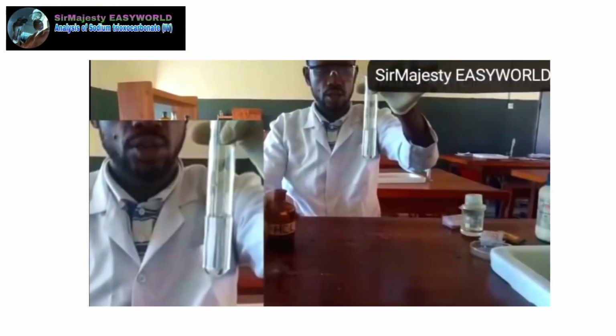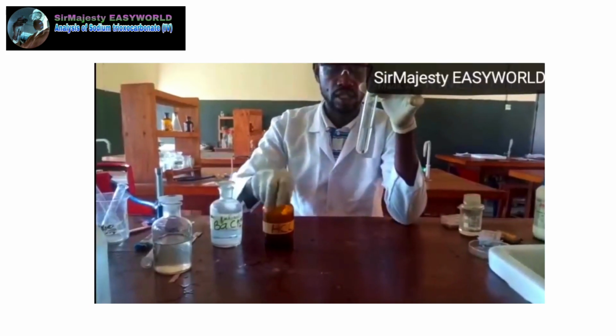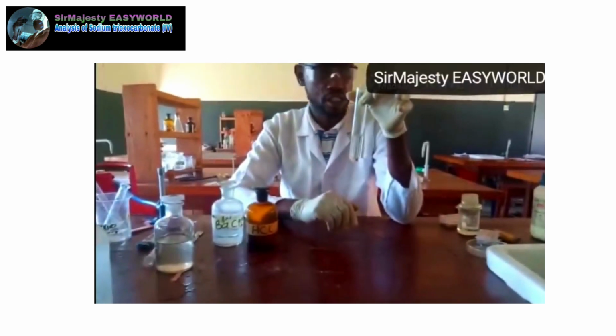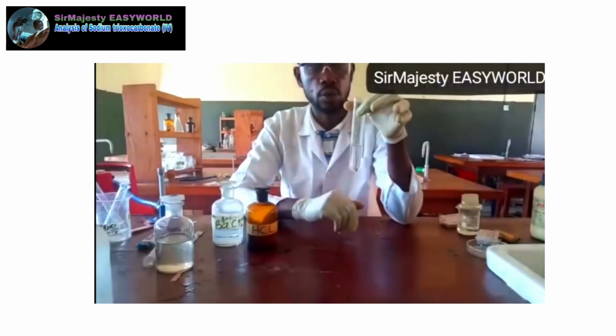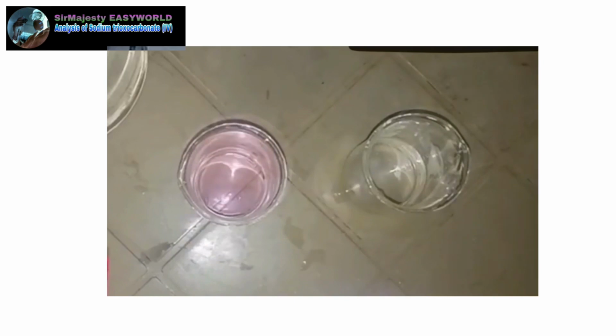Sodium trioxocarbonate 4 is one of the soluble carbonates that we have, and it is also stable to heat together with potassium trioxocarbonate 4. So the solubility will be tested. Then secondly, the action on litmus paper will also be confirmed. Sodium trioxocarbonate 4 will turn red litmus paper blue because it's a basic carbonate. It's a normal salt actually, but on hydrolysis it will have effect on litmus paper. This also implies that phenolphthalein in the aqueous solution of sodium trioxocarbonate 4 will be pink. That is, the indicator phenolphthalein will be pink.